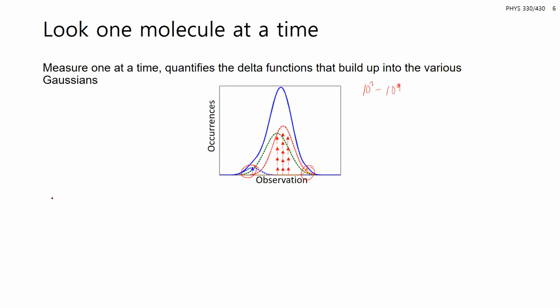So that's the big driving force of why single molecule spectroscopy is so powerful: you can isolate and observe individual events or behaviors that contribute to the ensemble.